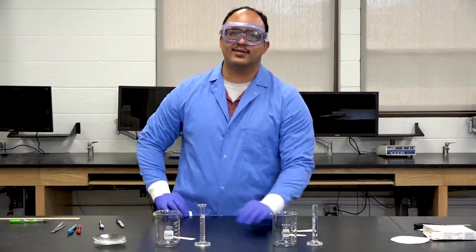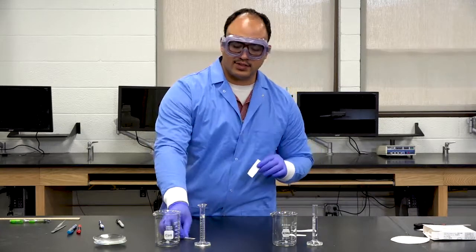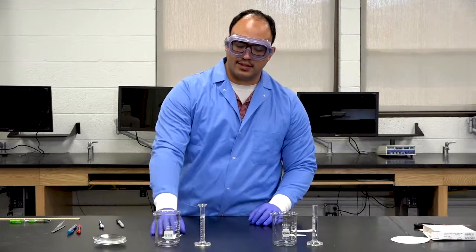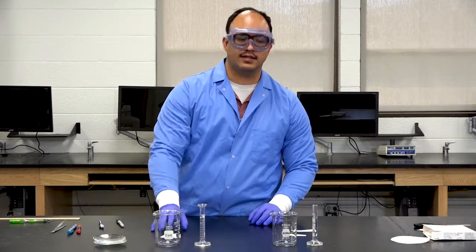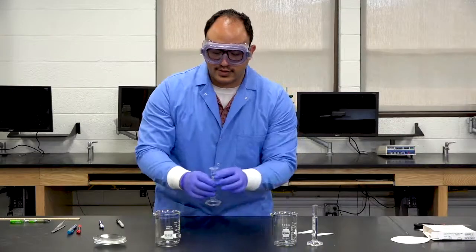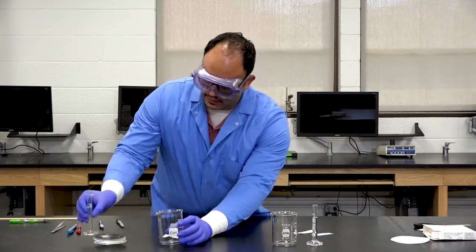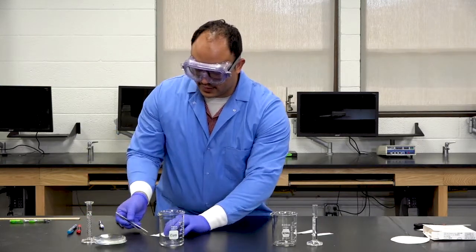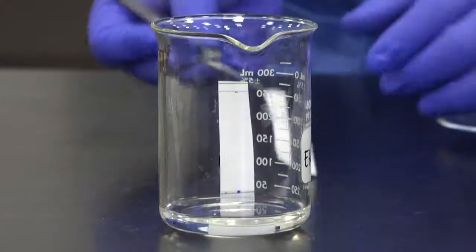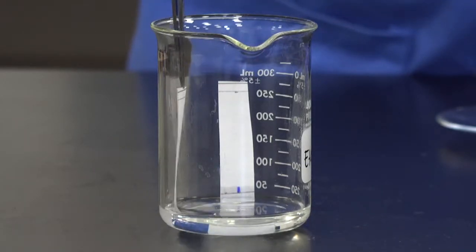We're going to do the test with one strip with a permanent marker and one strip of the oil-based pen. They're both going to go together in the beaker with ethanol, and likewise for the beaker of hexanes. First, we're going to pour our ethanol. And it helps if you have tweezers, or you may fold the chromatography strips lengthwise so that they're easier to stand.